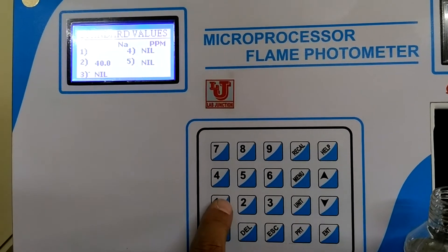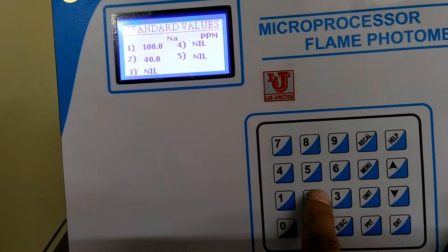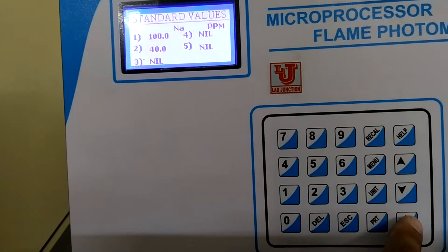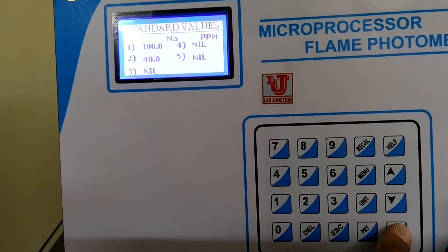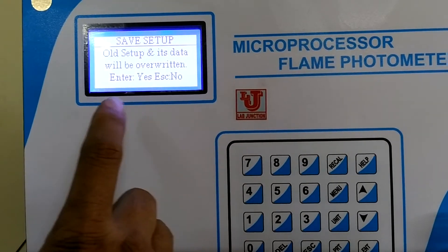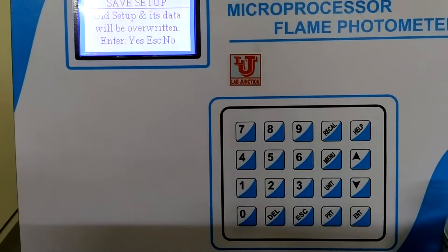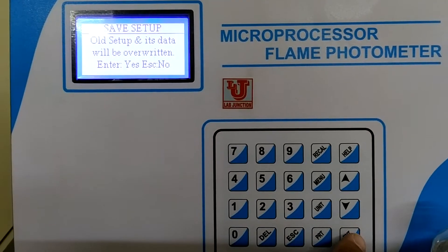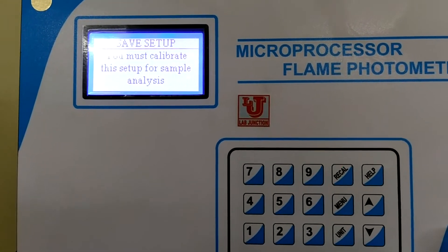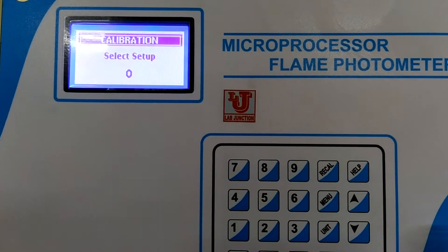First, I put 100 for the first sodium standard and press Enter. Second, I set 40 for the second standard and press Enter. It says all setup data will be overwritten — I press Yes. Setup data for file number 0 is saved. Now it says to go to Calibrate — press key 3. It automatically takes 0 for the blank.